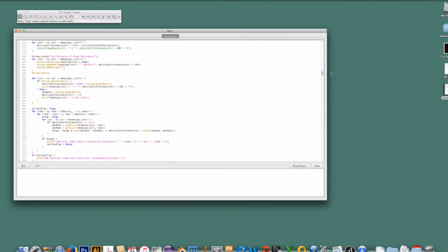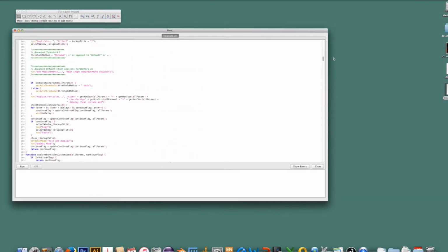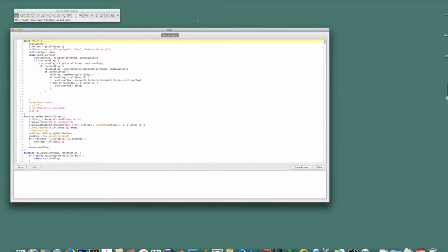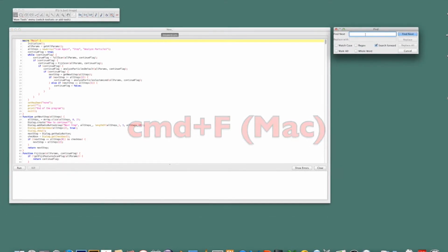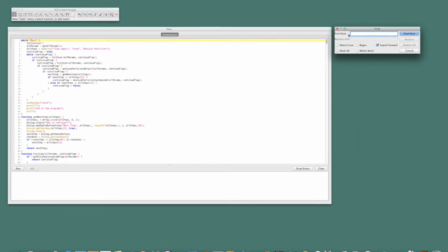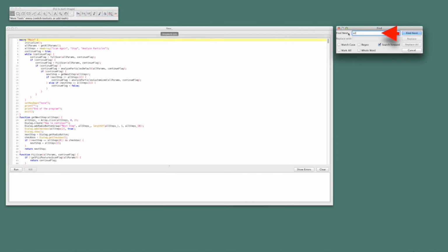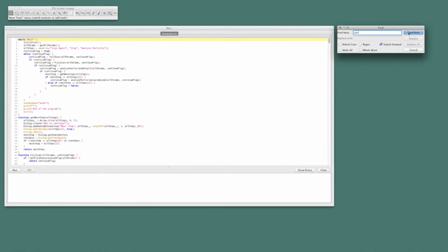If you look at the software, the first problem might be where to find the piece of code that's relevant to you. Well, that's easy. Just have InspectJ open in either ImageJ or, as you can see here, in Fiji. Press Command and F on a Mac or Control and F on a Windows system. And just type the word Advanced, or if these are too many characters, just type ADV and click Find Next or OK.